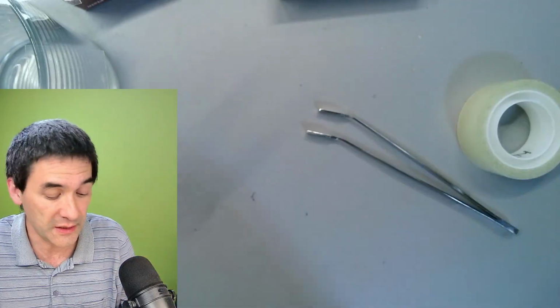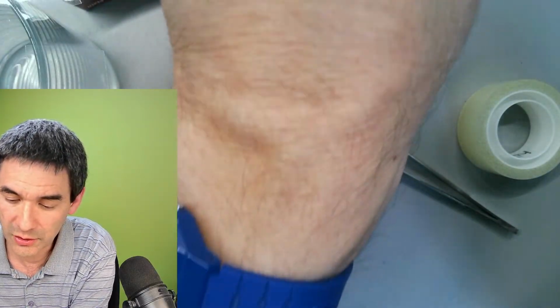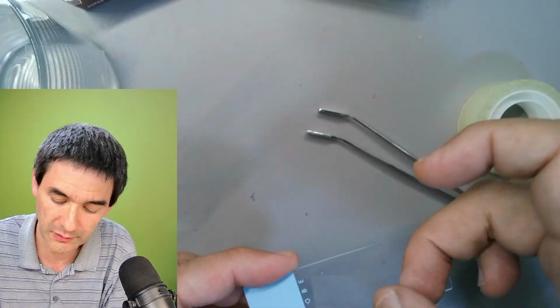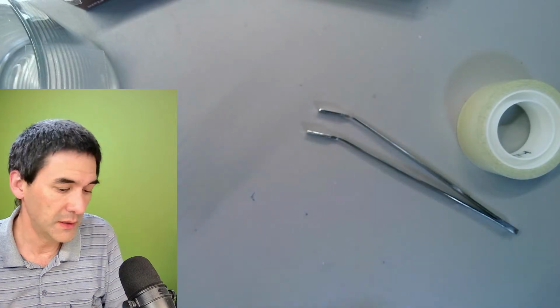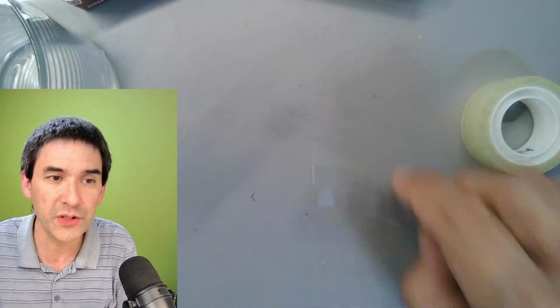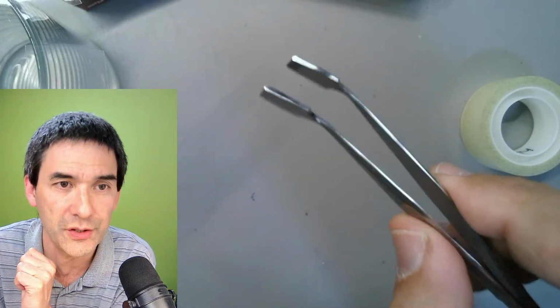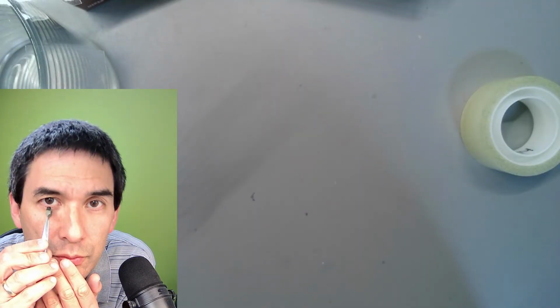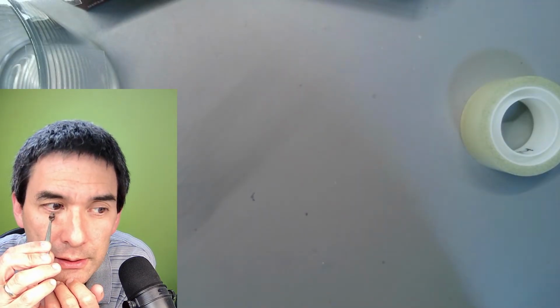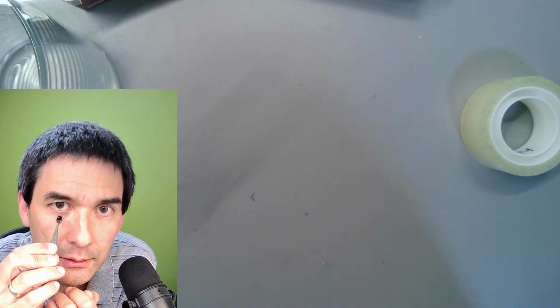So I'll be using the eyelashes. I mean, just for the sake of it, I can still put it on here, to keep it a little bit. So how does this work? Now I need to move a little closer. You take those tweezers here, those flat ones, and you carefully try to grab some of your eyelashes. You pull and you carefully rotate.